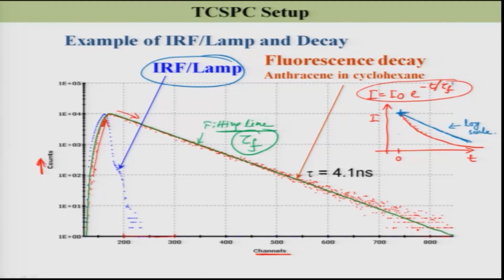Laser, then I have the constant fraction discriminator. What is its job? It is reducing the time jitter coming from the amplitude jitter of the PMT. Then I have the PMT itself, which has some transit time spread, which I can reduce, but it cannot be 0.